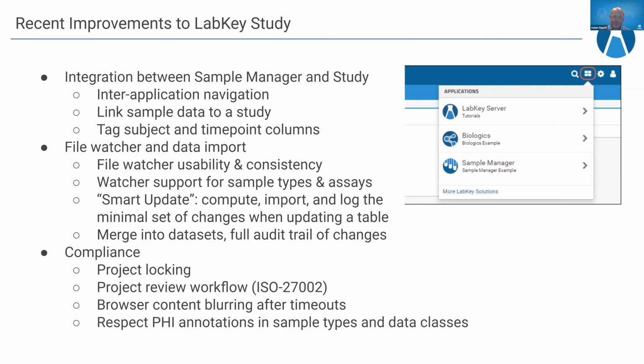This is all configurable by administrators. They specify all the details of what files to look for and what pipeline jobs to run. But this is one of those mechanisms that allows for completely automating the process of, for instance, data coming off of an instrument and being loaded up into LabKey in the middle of the night with no manual intervention needed. We've added support, in addition to usability and consistency changes, so making that user interface and the configuration much easier to use. We've added support for more data types, including sample types and assays. So the full range of data you might load up into a study can be loaded via a file watcher.